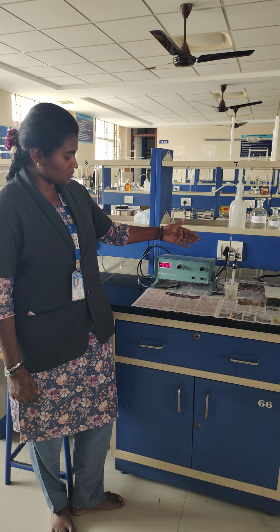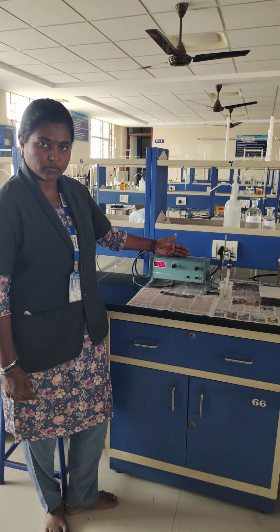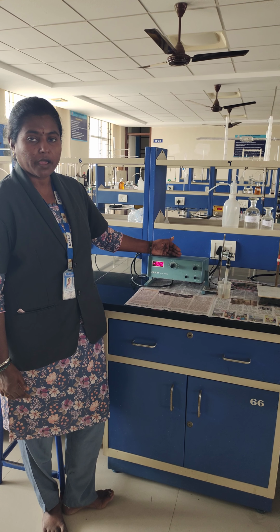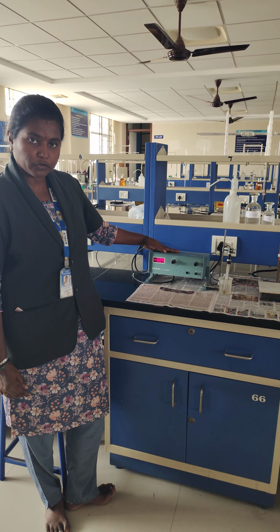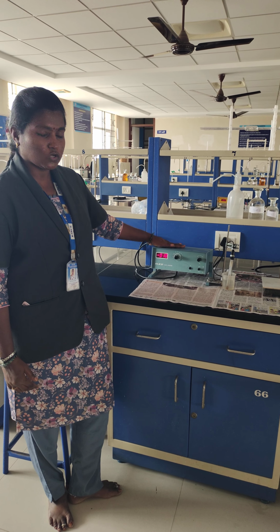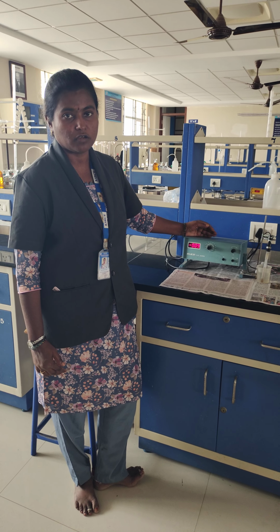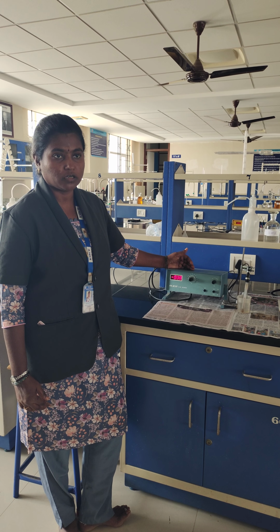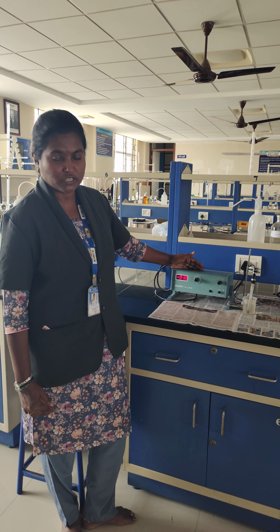In this, a glass electrode is used as an ion selective electrode. There are many ion selective electrodes. This glass electrode is especially used for measuring the H plus ion concentration. This meter shows accurate measurement for H plus ions. It is used in many laboratories, especially for measuring water quality, with parameters like acidity, alkalinity and other parameters considered for determining the quality of water.